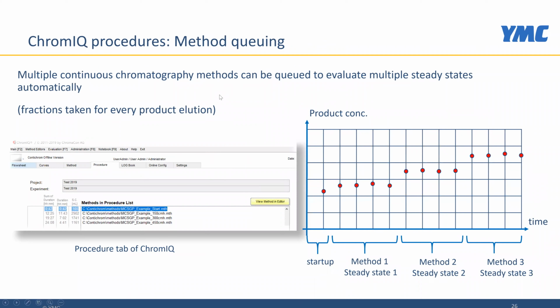Also, with the buffer management, it's also possible to calculate the buffer consumption once the run has been operated, but I come to that later.